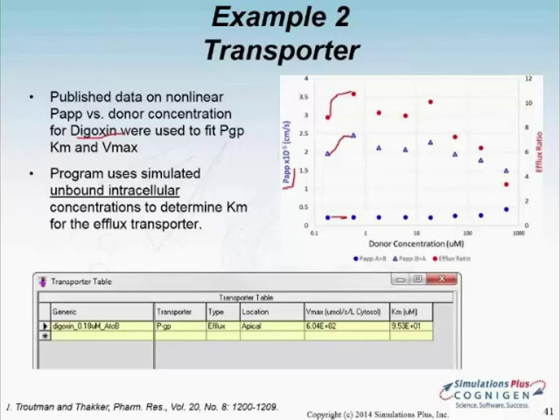So if you are looking at the diffusion of the nanoparticles themselves, that part we are not accounting for. So the question is whether your delivery system is looking at absorption or the permeability of the whole nanoparticles, or whether the drug is being released from the nanoparticles and then permeates, in which case the overall permeability that you may be observing would be a combination of the rate of release from your nanoparticles versus the permeability of the API alone.